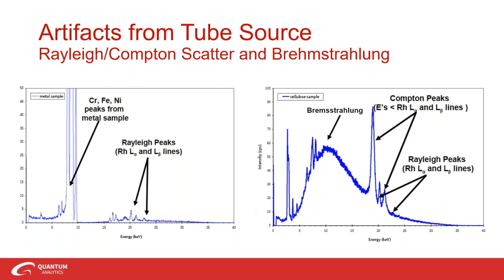The peaks are arising from the target anode in the X-ray tube source. Here in this case, it's using a rhodium source. This may appear in all of the XRF spectra that are acquired on the instrument, so they'll be consistent. This is typically observed in spectra of dense samples as weak peaks, so that's why you see them so small here.